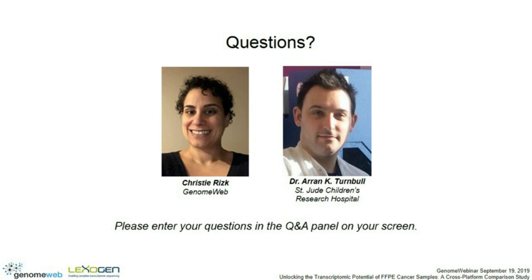What we've shown before is that if you have all of one particular biological feature in one data set and a different subset enriched in a second data set, the correction methods sometimes are not appropriate in that case. So really, we've aimed to always integrate studies which are similar in their composition. Obviously, that's a very difficult thing to think about.